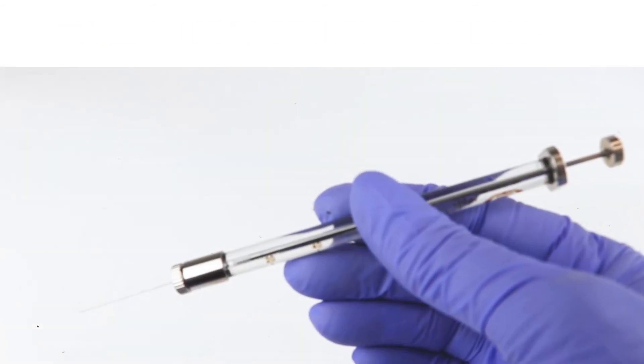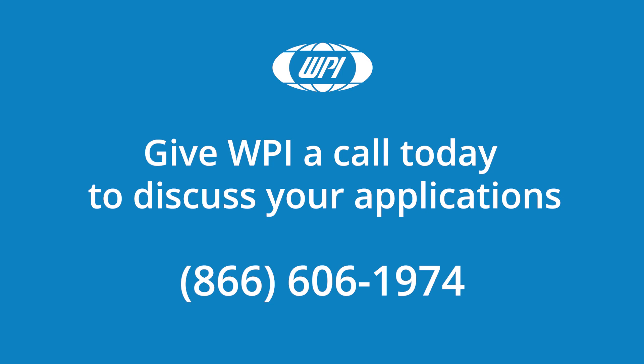That's how you change a needle in a Nanofill syringe. If you have any questions, just give us a call.